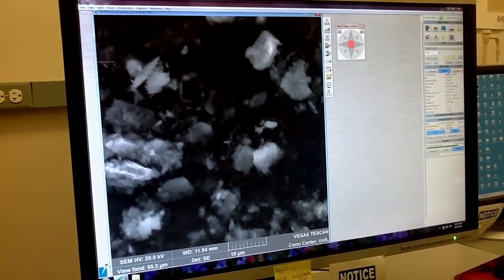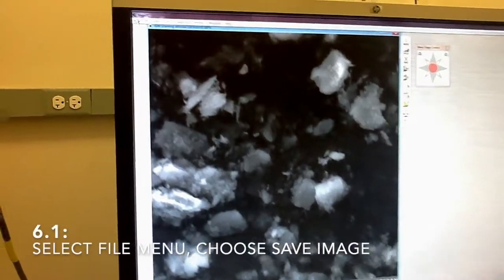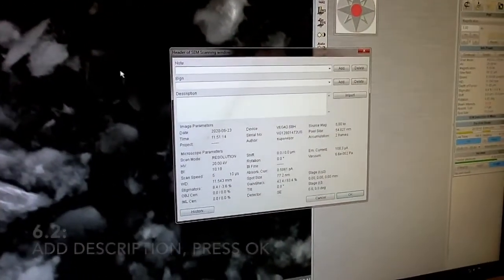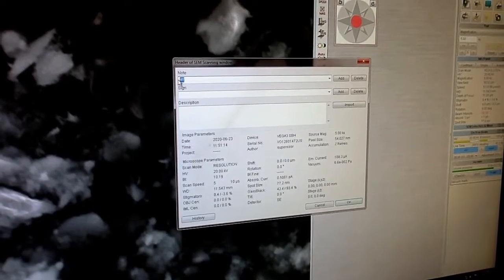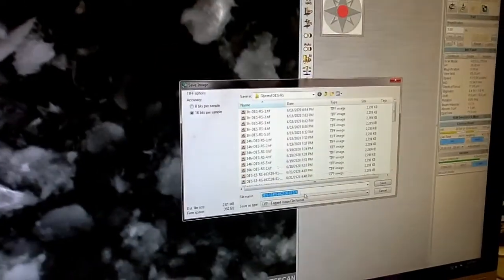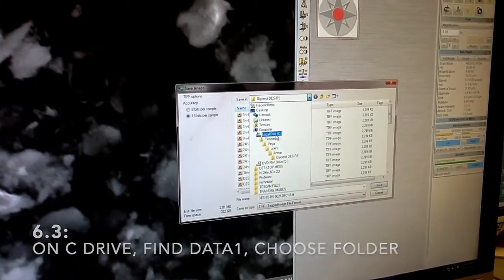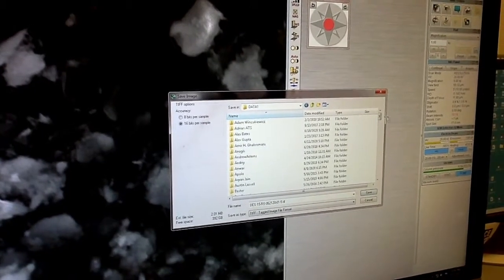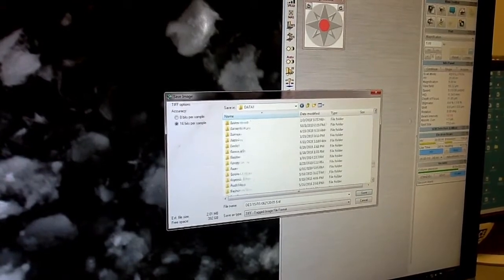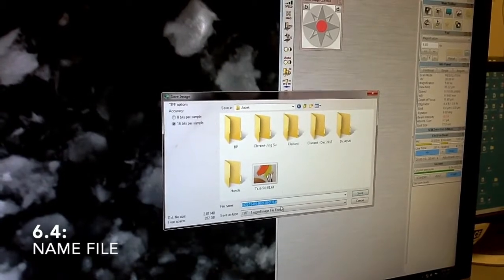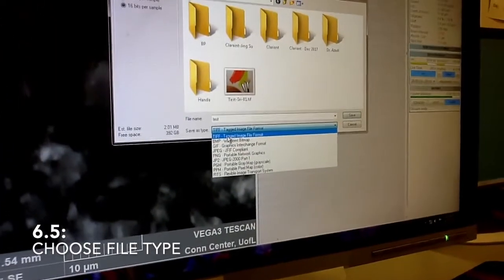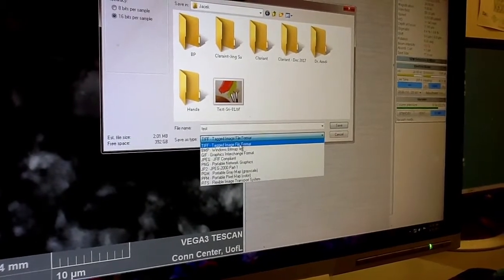Now if you want to save the image, just go to Menu and Save Image. Put whatever description you want. You don't need to change the folder — I will save this as a test file. Make sure to select the TIFF format. You have other formats available, but this is the one I recommend.